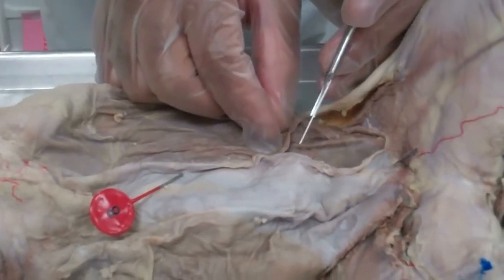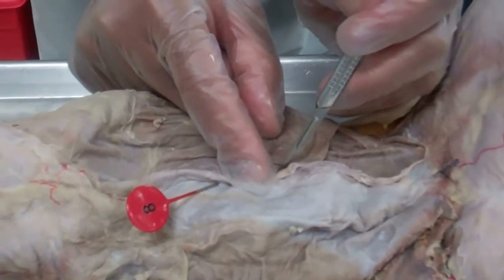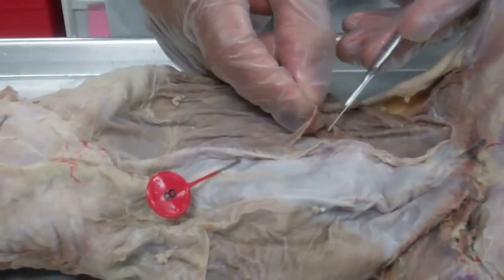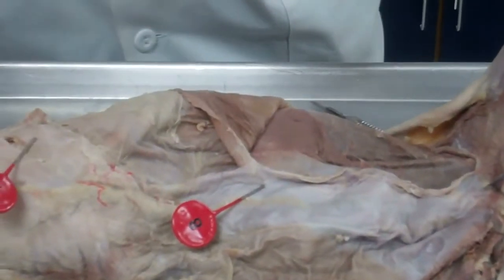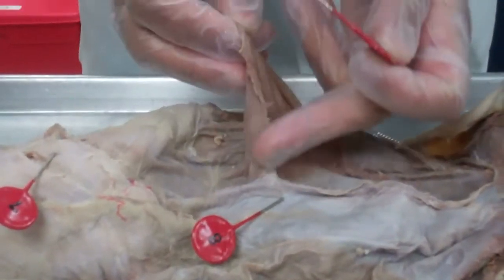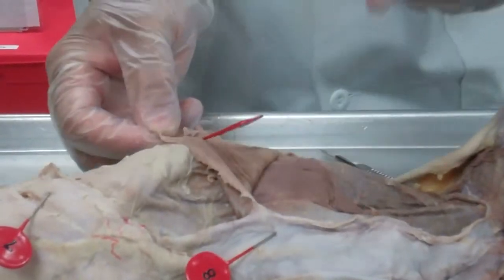So these muscles are very thin. You have to be very careful and go along the fascia line, and then you'll be able to peel back the muscle. This first layer here, number 9, you can see how thin the muscle is. This is the external oblique.